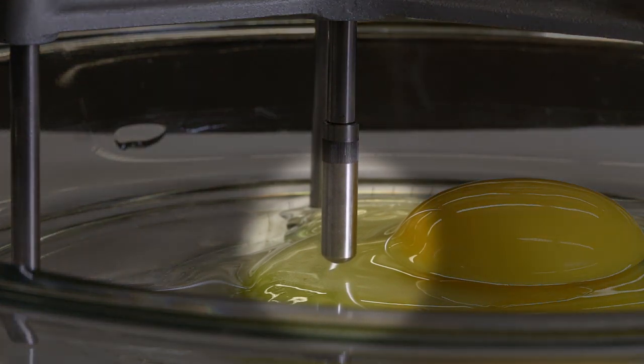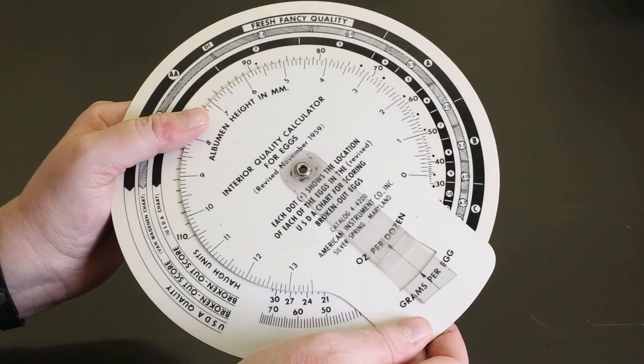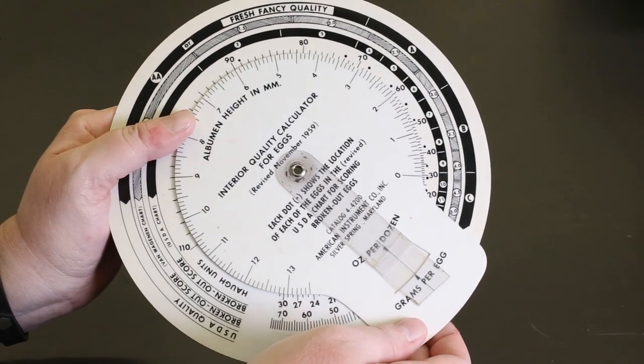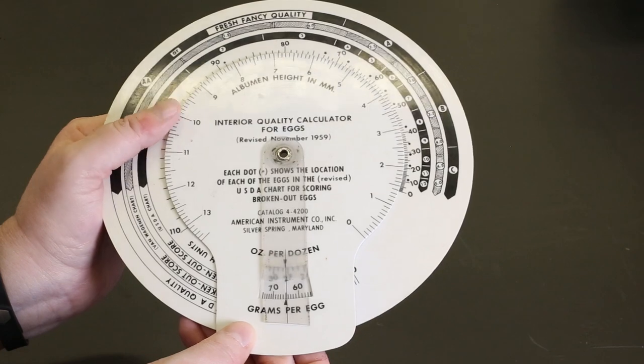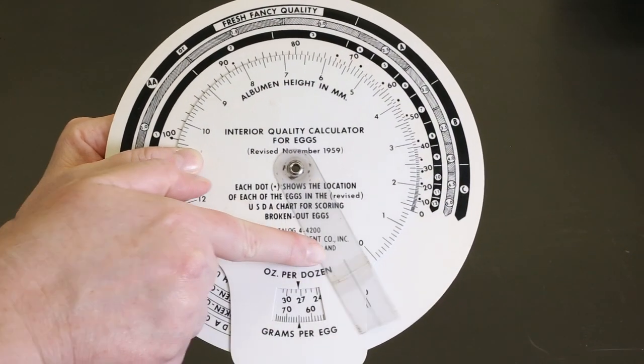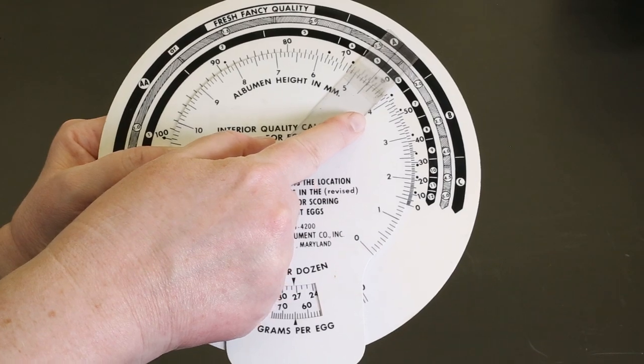As you can see, the albumen appears to jump up and touch the probe. The reading on the micrometer is recorded and used to calculate the HA unit. A HA unit calculator determines the interior quality score as well as the USDA grade. The weight of the individual egg is used to set the scale, and using the height of the albumen, the score and grade are determined.